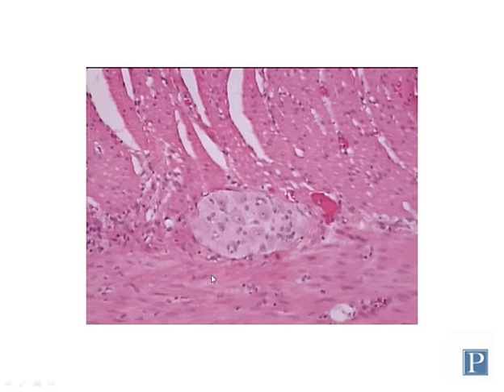These smooth muscle fibers are oriented perpendicular to each other. So here's one layer of smooth muscle, and here's another layer. You can see the transition right here. Right at the transition point between the two layers of smooth muscle is where you can find these parasympathetic ganglia. You can find parasympathetic ganglia elsewhere. This is just one example of them that we're going to look at.